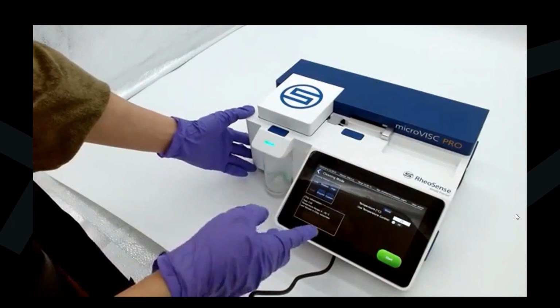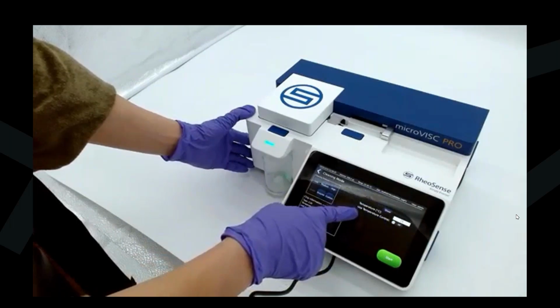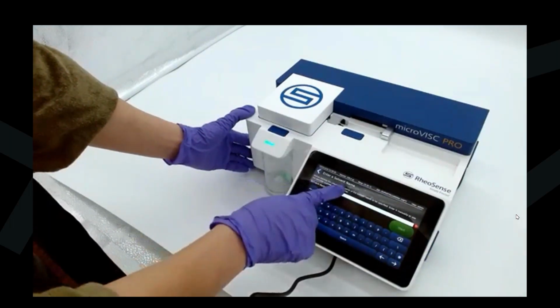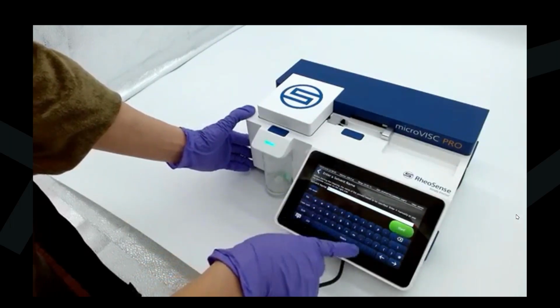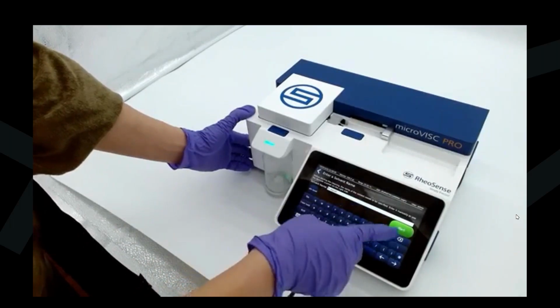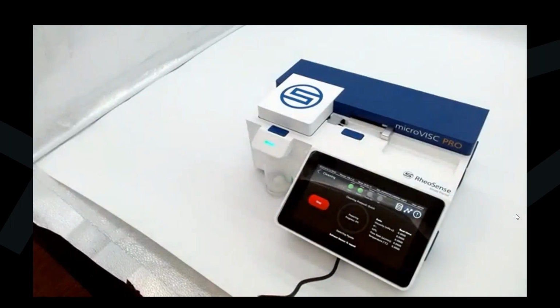So we're going to use the quick cleaning option, no temperature control, and then we're going to hit start. We're going to enter the name of the cleaning solution. And as you saw, you can use temperature control as well. So if you want to clean at elevated temperatures, that's another option for you.